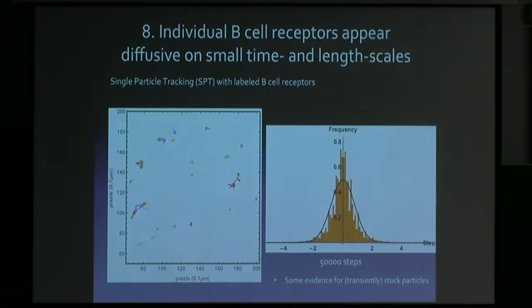And so then we can see how well, for example, the x-coordinate of the step length correlates with a Gaussian function. So here's my Gaussian fit, and here's my histogram of step lengths over 50,000 steps. And you can see that it's actually not too bad. It does approximately look like Brownian motion should look.